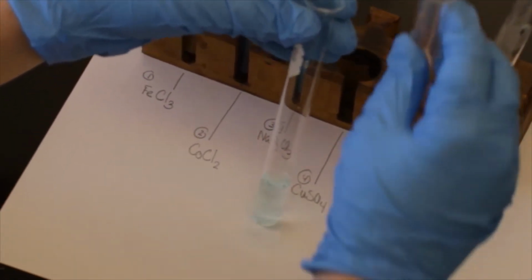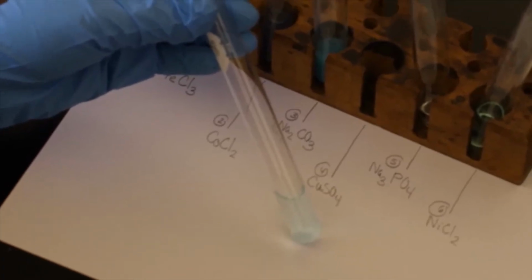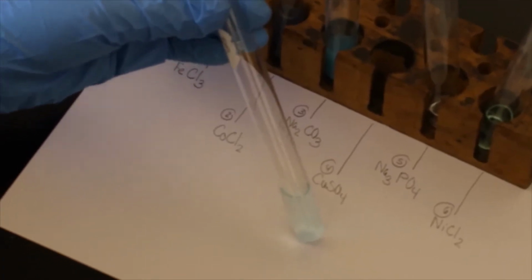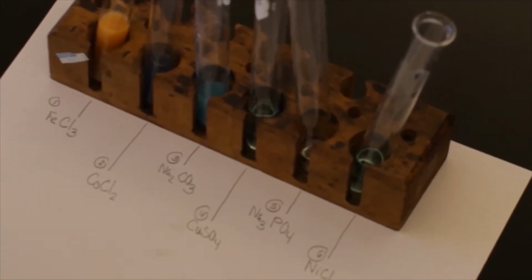And realistically, nothing happened here. There's no solid formation. Color still seems the same. Nothing really.